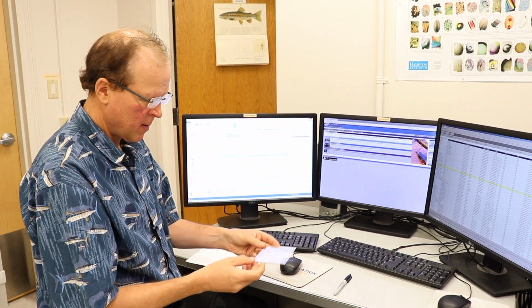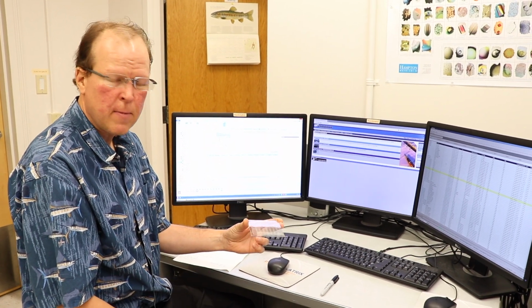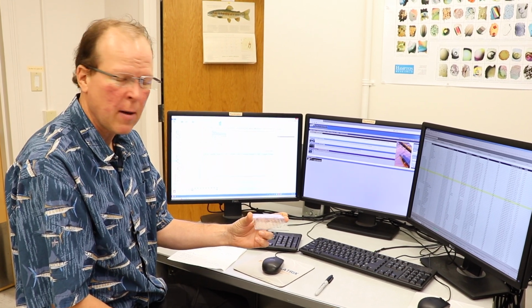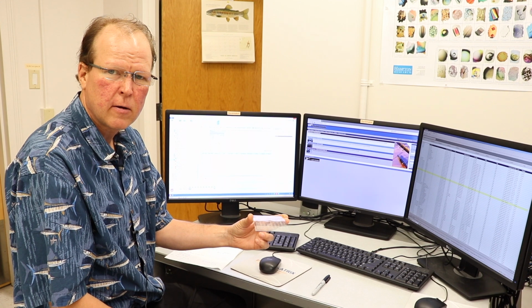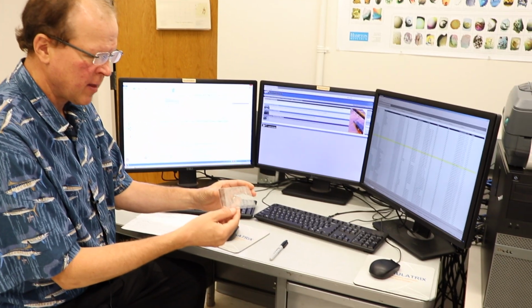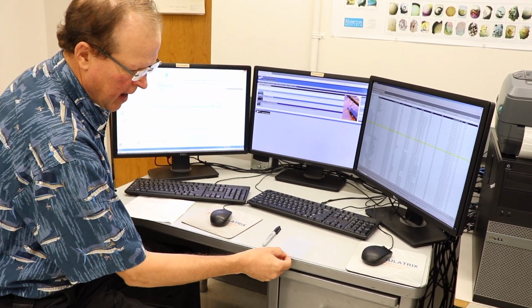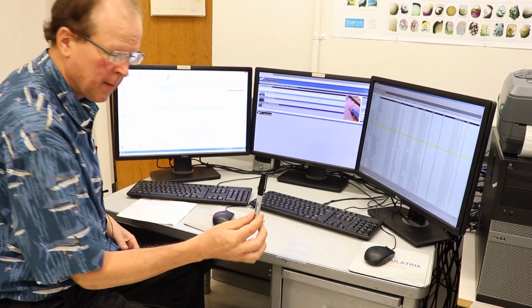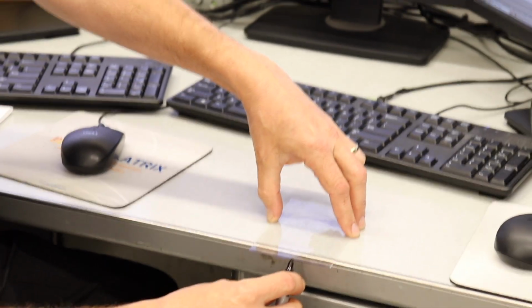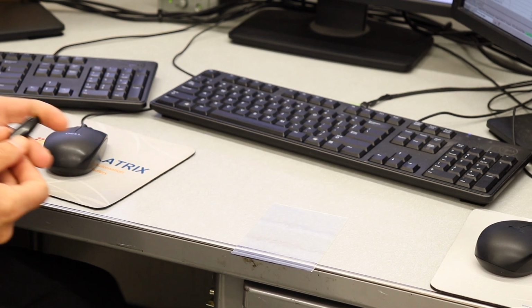Okay, in this segment, we're going to learn how to use the RockImager 1000 to image an LCP plate, which is for looking at crystallizing membrane proteins in a lipidic cubic phase. Here's our plate that was set up on the Formulatrix NT8. First thing you want to do is take the glass plate and take a black Sharpie and mark the edge at the 12 end of the plate. That allows the barcode reader to find it a little bit better.